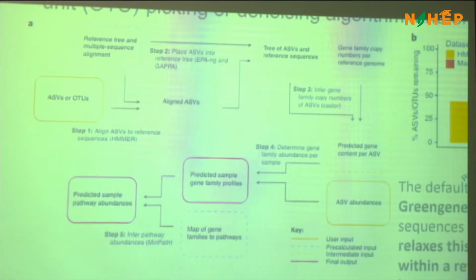That's the reason I'm saying it gives you an overview of the pathways. It will tell you that these are the pathways for metabolism, or these are the pathways for carbohydrates, these are the pathways for lipid metabolism, whatever. These are the pathways which are available. But always remember there's a small region which we are sequencing, and then we are identifying that. So there is a simulation which we are doing here.